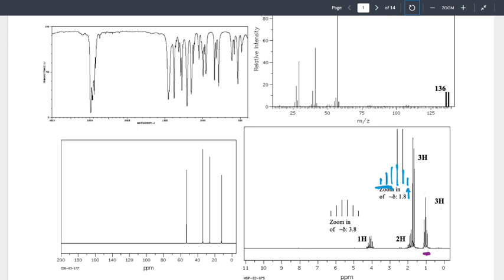How about when I go the other way? 1, 2, I'm at carbon. That doesn't count as a neighbor. 3, is that a neighbor? That is chemically distinct from this one. So this one counts as a neighbor. It's within 3 bonds. 1, 2, 3. Yeah, that's a neighbor. We'll get some people saying, but isn't it the same as this one?